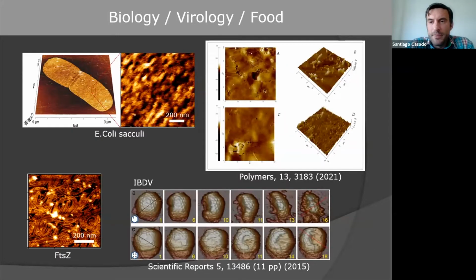So, for example, what can we measure with AFM? I have, for instance, checked the peptidoglycan network of the sacculi of some bacteria, for example Escherichia coli. Most bacteria have a structure that maintains their shape and prevents them from breaking up, basically. One of the strategies is to form this peptidoglycan network, which can be checked by AFM just by adhering the sacculi on a flat surface. If I remember, it was mica, not HOPG. We can do that with HOPG, but it was done on mica.